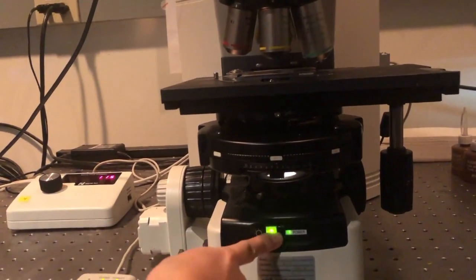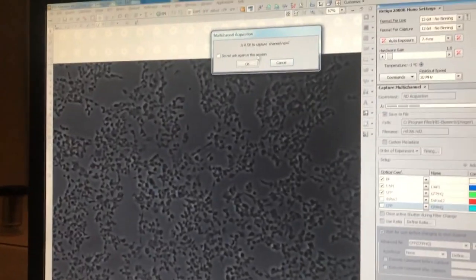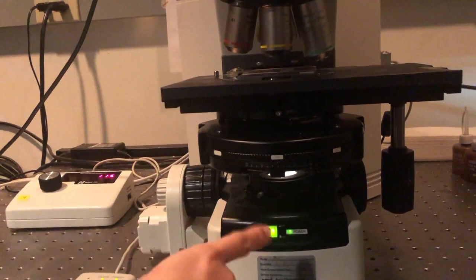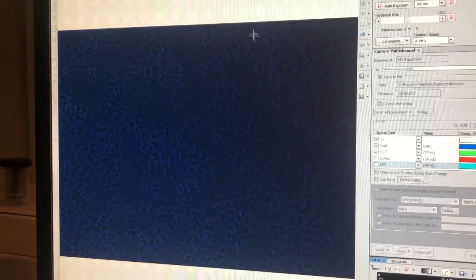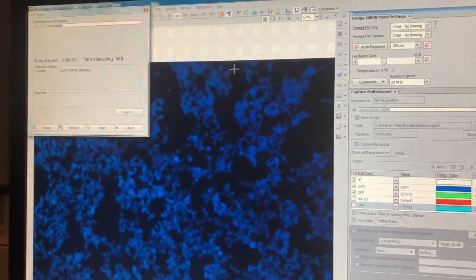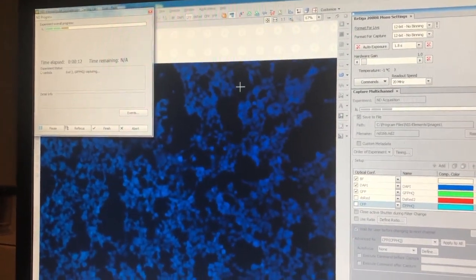For Brightfield imaging, turn on the halogen lamp. For the subsequent fluorescent images, make sure the lamp is off. The program saves the exposure times that you set earlier for each filter set, so just click OK for each dialog box that pops up.